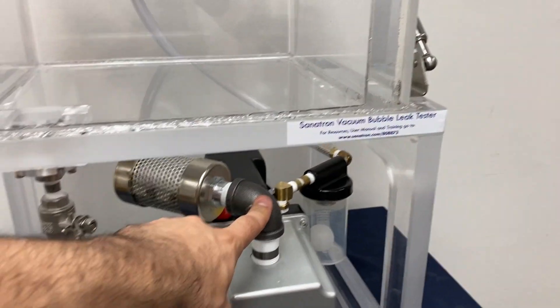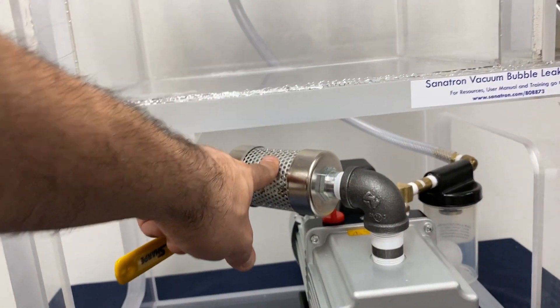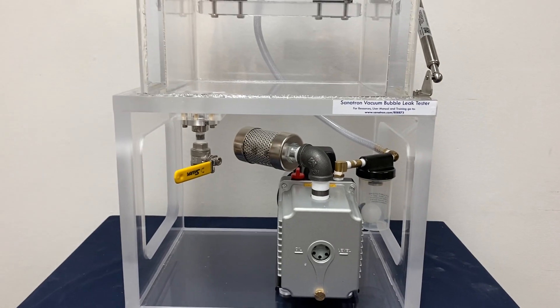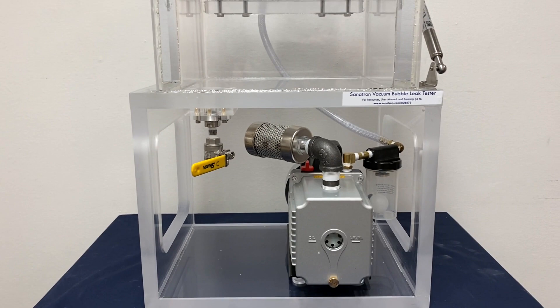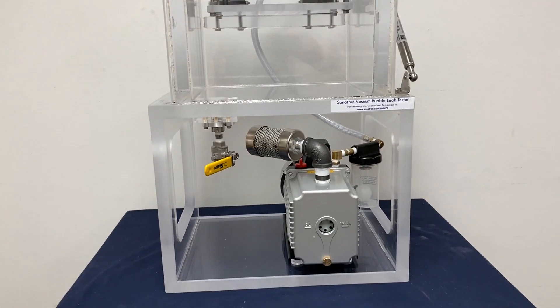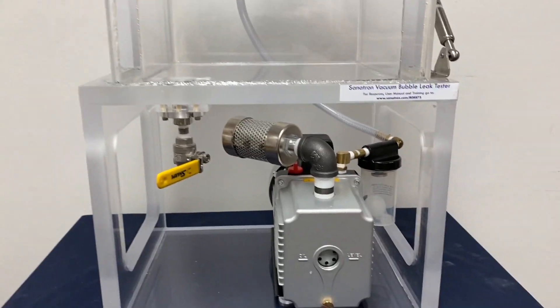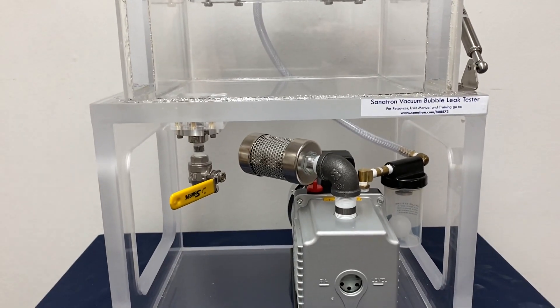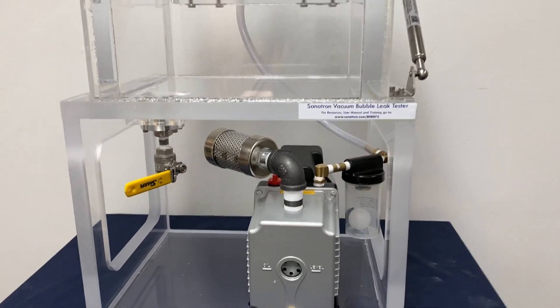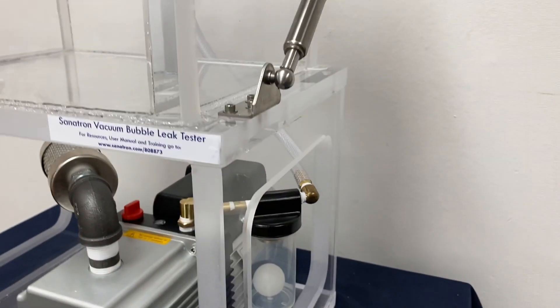Our rotary vane pump comes with an oil mist eliminator or exhaust filter as standard, so you don't have to buy anything extra. This is a fully assembled and ready to go system, and it will keep the exhaust eliminated up to 99.98 percent.